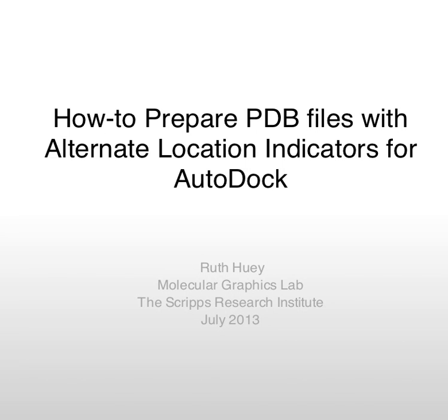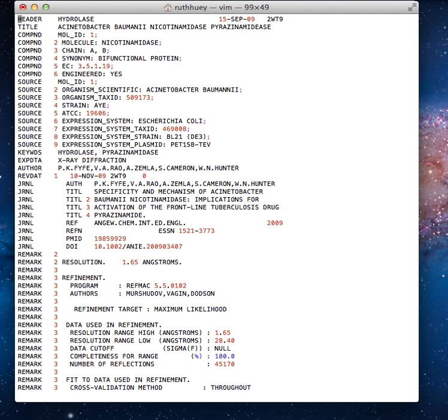This video, how to prepare PDB files with alternate location records for AutoDock, introduces alternate location indicators and explains how to prepare input for AutoDock from files that have them. The molecules in some input crystals for X-ray crystallography may be in slightly different conformations. Consequently, the resulting PDB files have multiple coordinates for a single heavy atom.